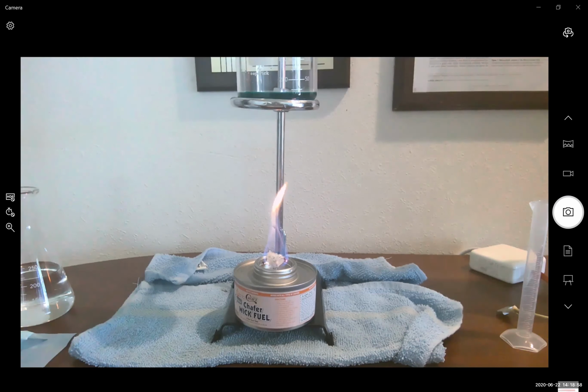So we'll heat until at least 238. That's our cutoff. 238 is our cutoff. So we're just going to let this go for another 18 minutes. During this time, you can get your other materials ready to go for the subsequent steps.